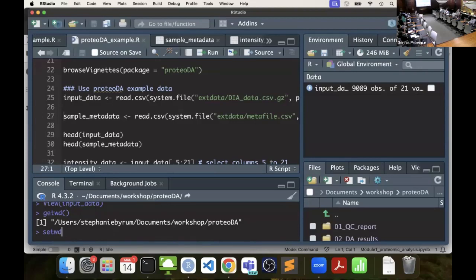So this is also the reason why we turned this into a package. Regular R scripts work really well. It's fine if you have everything installed on that machine and you never change versions and no other package ever updates, then you're good. But once another package updates, everything's broken and it won't run anymore. By turning it into a package, it's more self-contained, and all of those versions and dependencies are built in together, which makes the install process much better. This took us a year to take all those scripts and turn it into an actual package. So yeah, it was a team effort for sure.